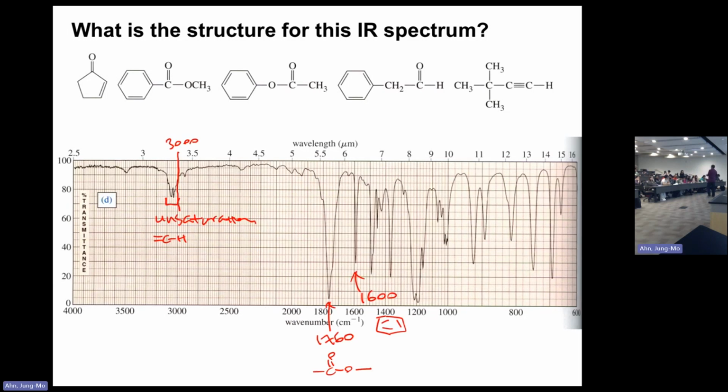So what else should we use to figure it out? That is a question. So let me first point out, remember, you know what that thing is now, right? That small thing there, coming down close to the 3500, that is definitely the overtone of this. So now you see that it appears a lot with the carbonyl signal. So now you can simply ignore that.